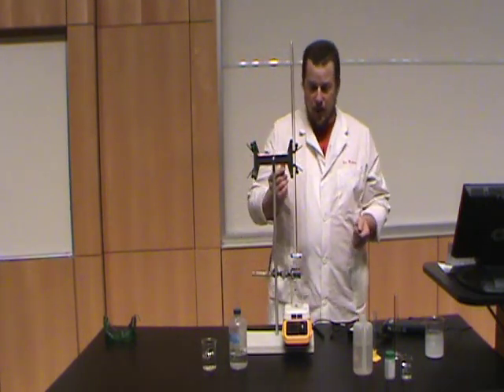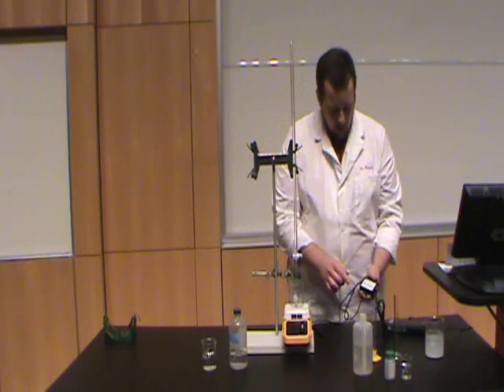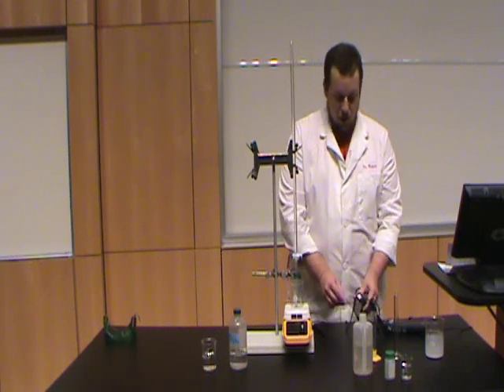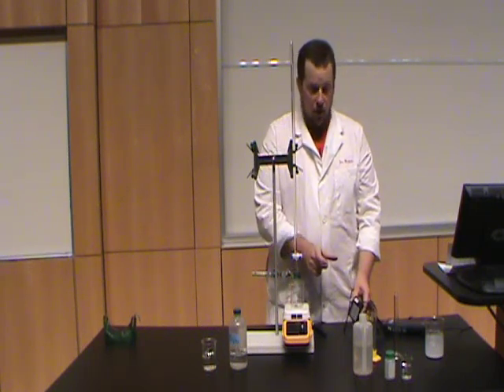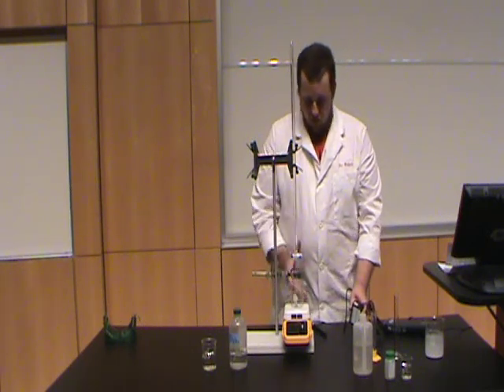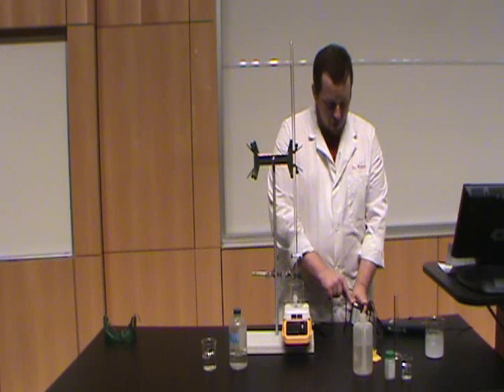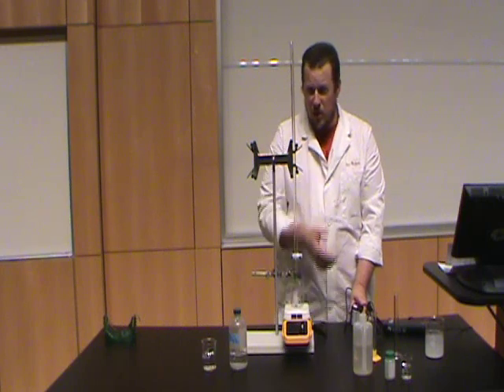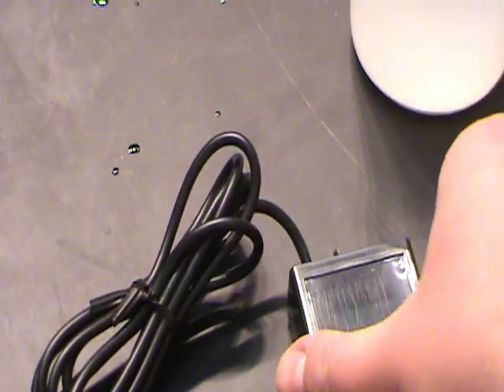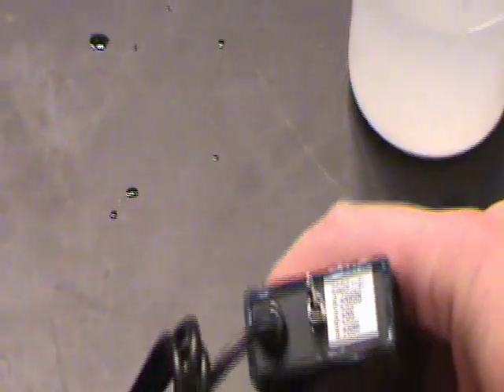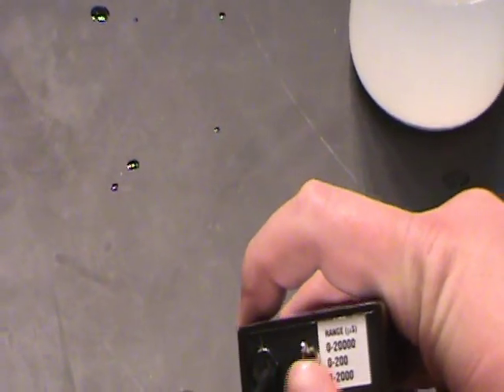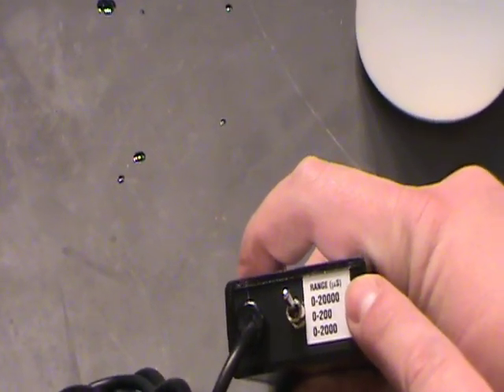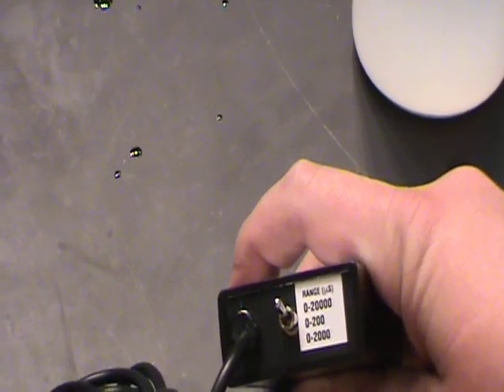Here's where there's a slight error in your lab manual. Here's the conductivity probe meter box, and there's a switch on that meter box which selects the range of conductivities for your experiment. For this experiment, it actually works better if you switch it to the 0 to 20,000 range. Your manual says the 0 to 2,000 range. So make sure that you move the range selector up to the 0 to 20,000 option before you calibrate your conductivity probe.